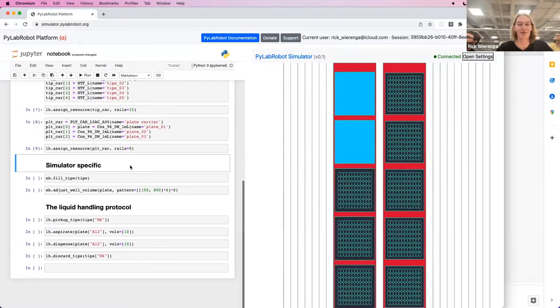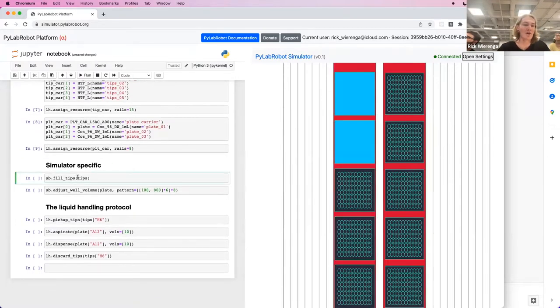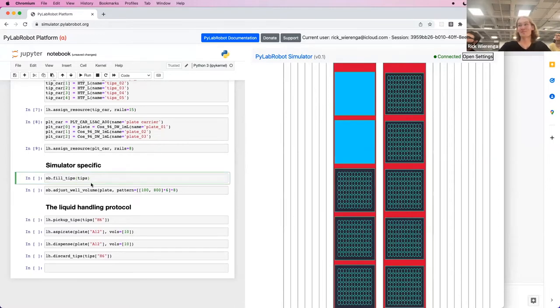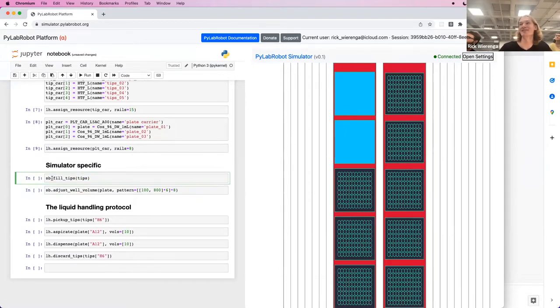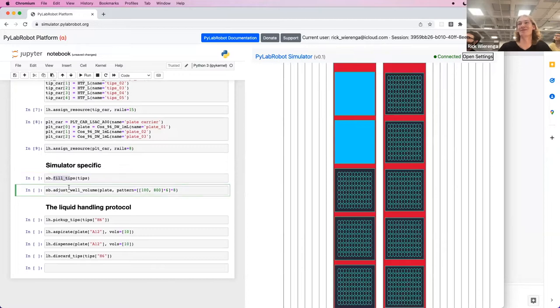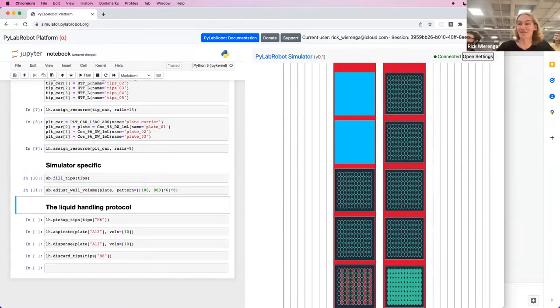Let's do the same for a plate carrier here. And then on a real robot, you would need to fill the tips in the tip rack and put liquid in the wells. In the simulator, you cannot do this. So you provide these methods called fill tips and set well volume, which do what they sound like.